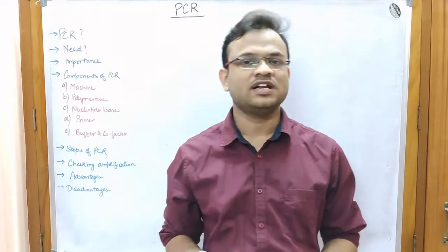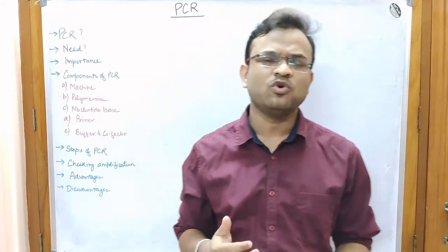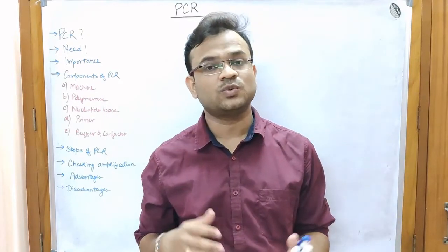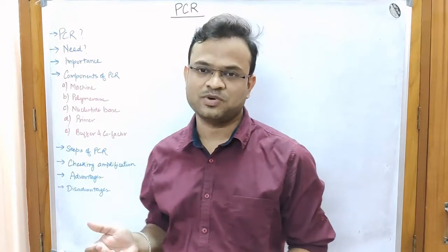The topic that we would deal today is PCR. This is a very important technique and it is used for amplification of the DNA, and in most of the molecular biology labs throughout the world this PCR machine is run on a daily basis for research purposes.